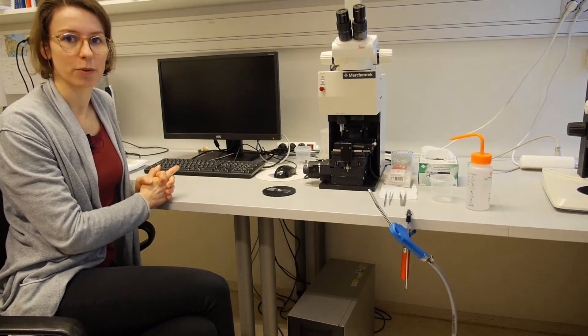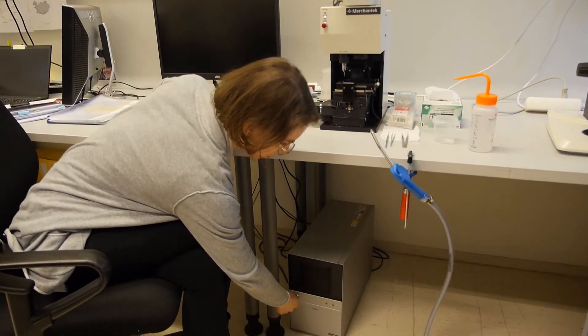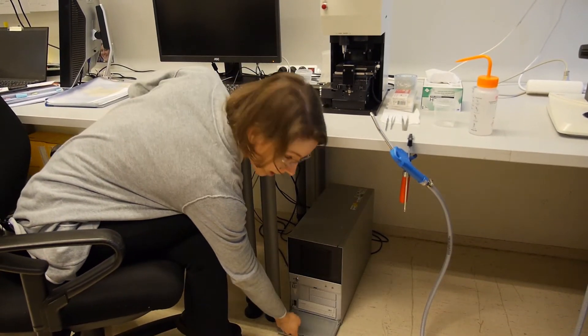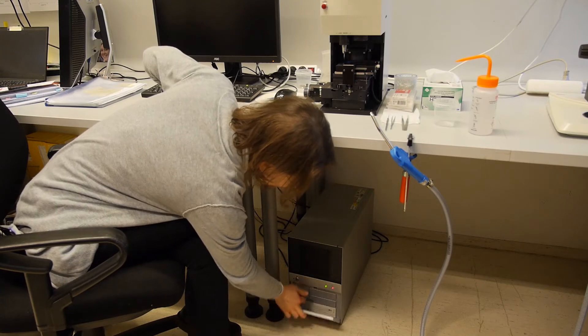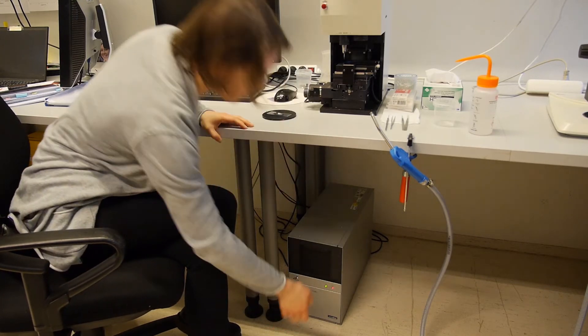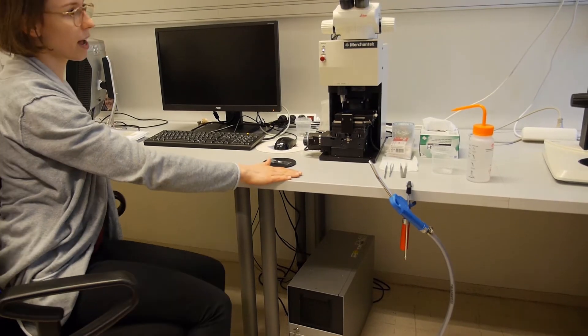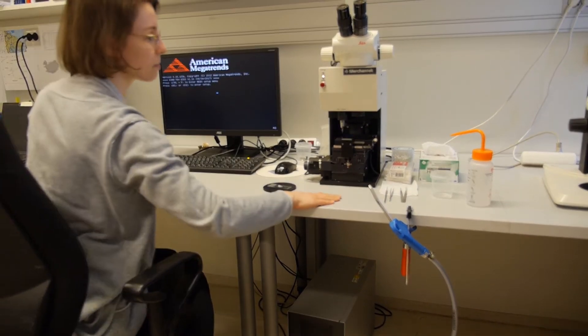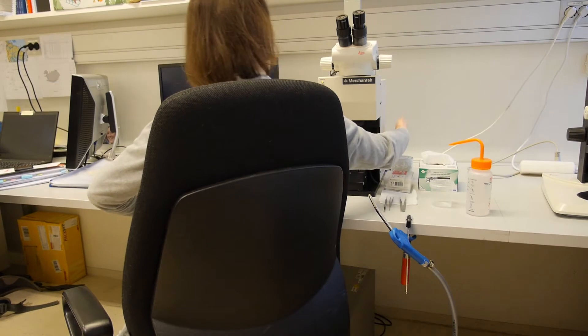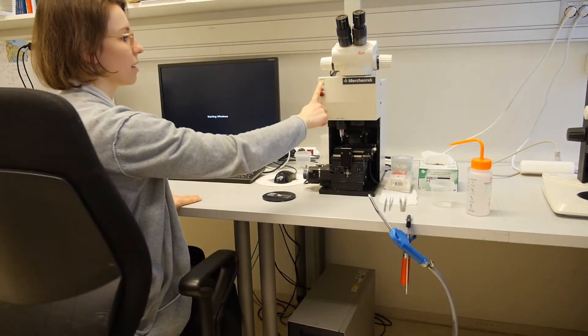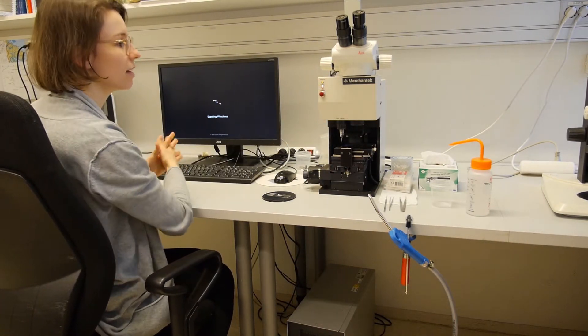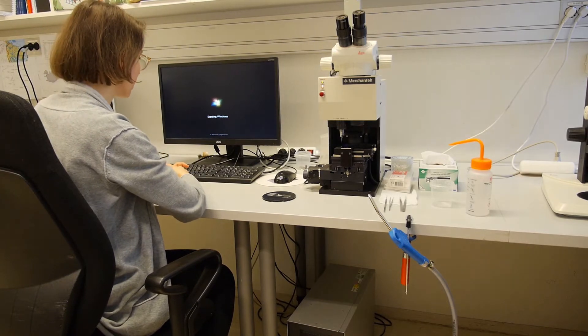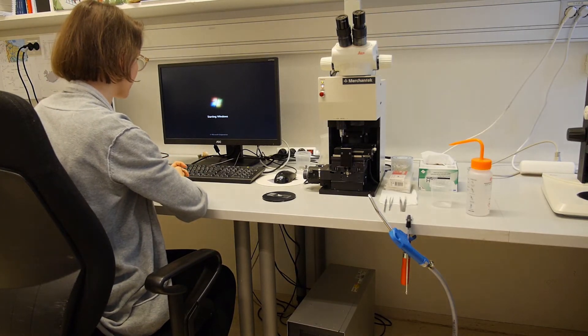First of all, we have to turn on the computer. The computer is on the floor. You do have to unlock it, push it and press the button. And the computer is starting. You also have to turn on the micro mill. It's a button on the right back side. Then this yellow light shows us that it has been turned on and the computer is starting.